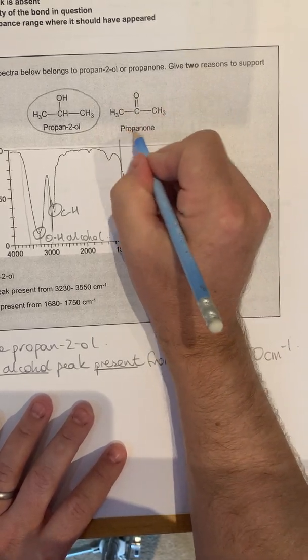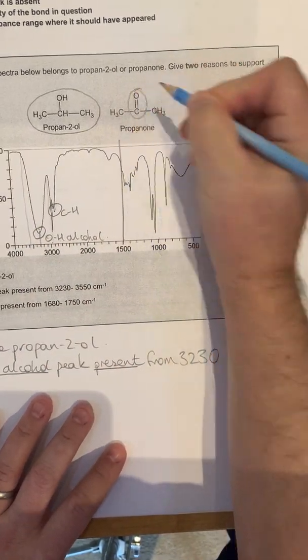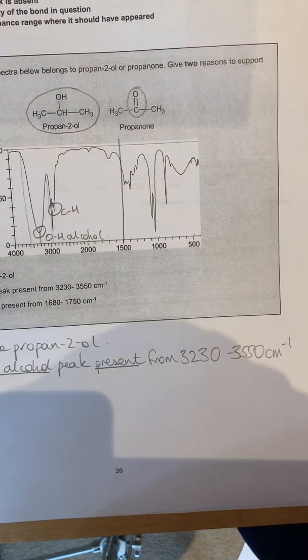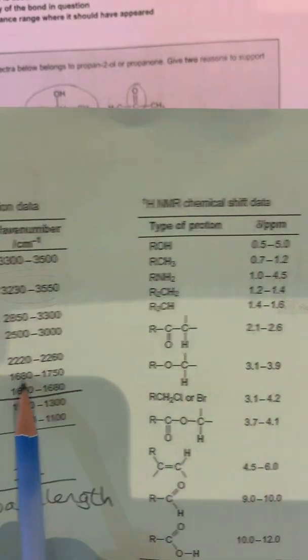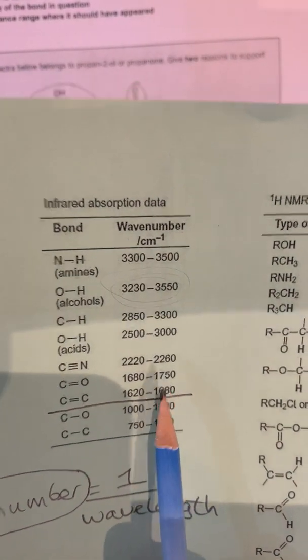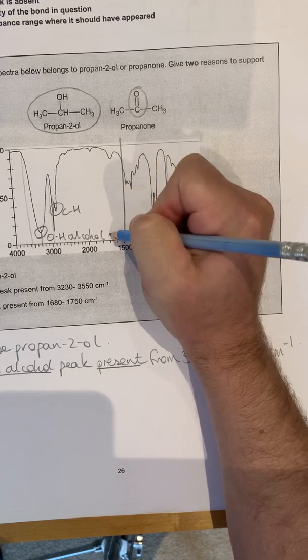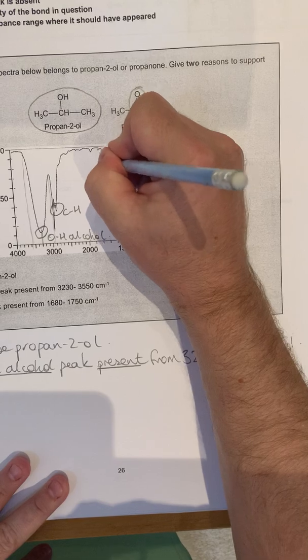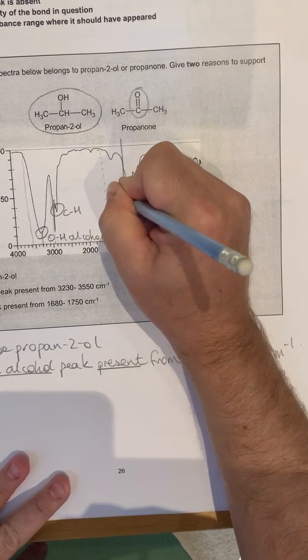So from the point of view of why that couldn't be propanone, is due to that C double bond O, that should be present from 1680 to 1750. And that's that big stalactite one around about 1700, which we haven't got. So we'd need to see a peak all the way down there in that position.